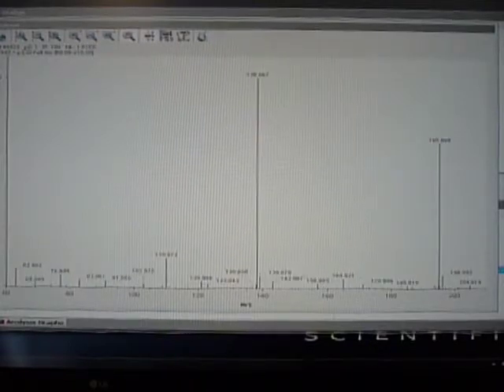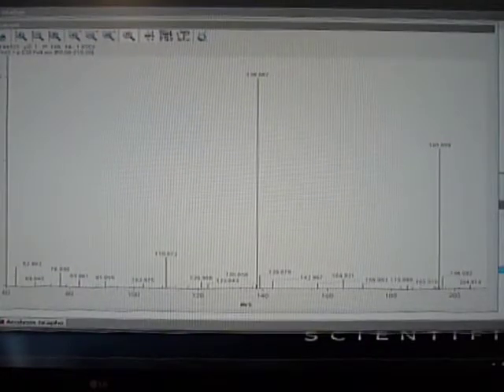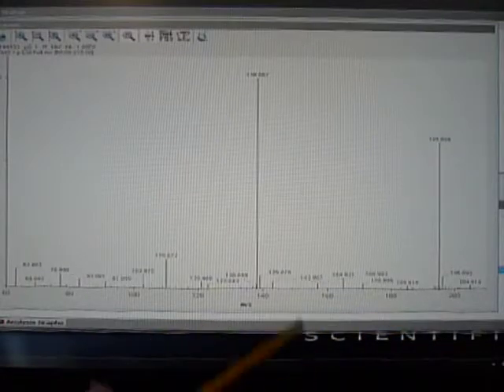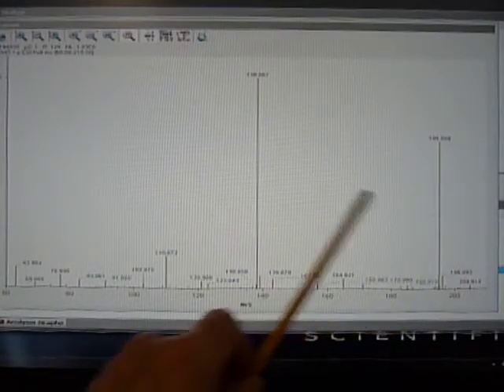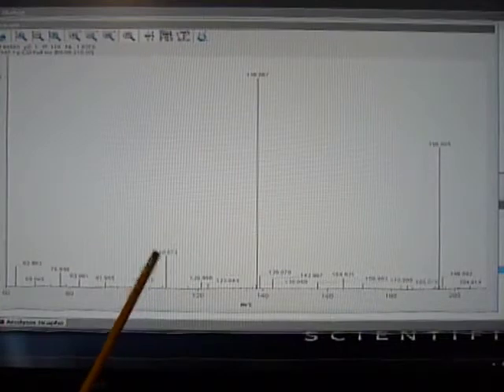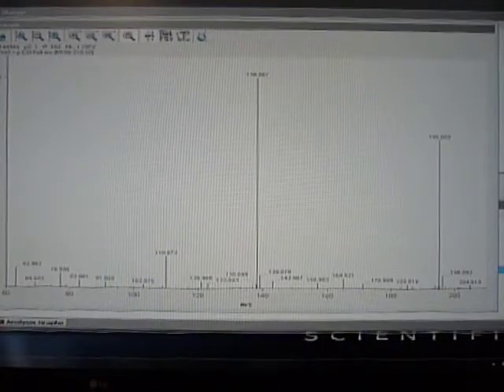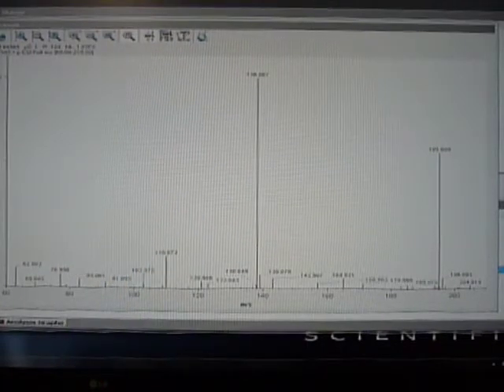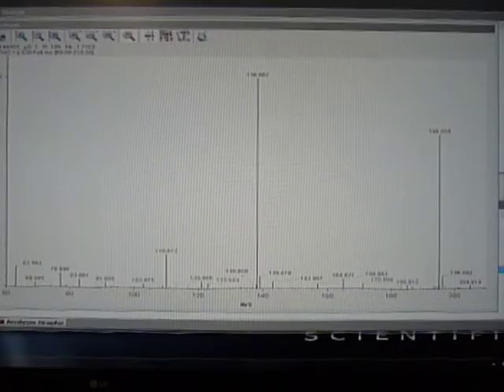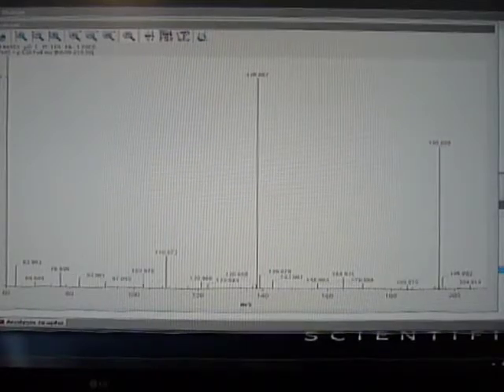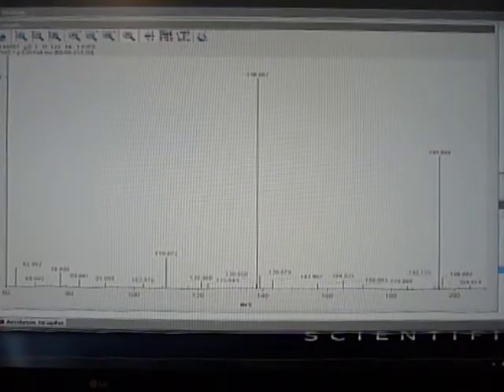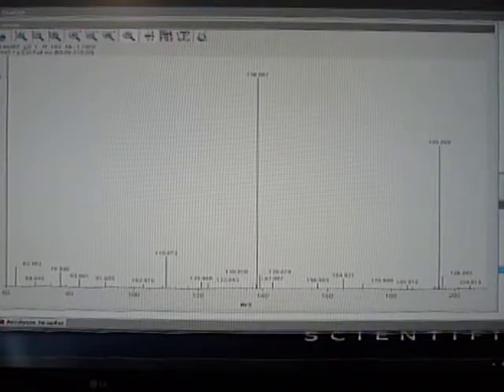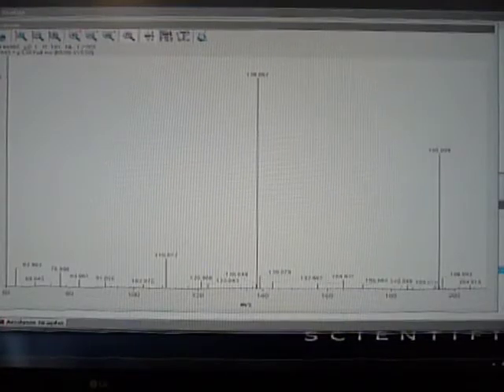Now we have more enhanced fragmentation. This is our M plus 1, and look, we have a secondary fragment there also. This is essentially a way of getting CID outside the mass spec, in the source, before it actually enters the mass spec.